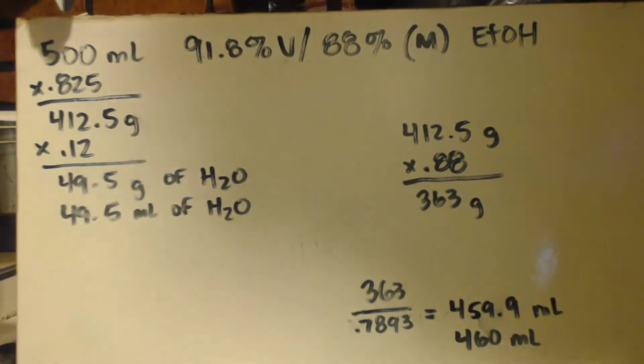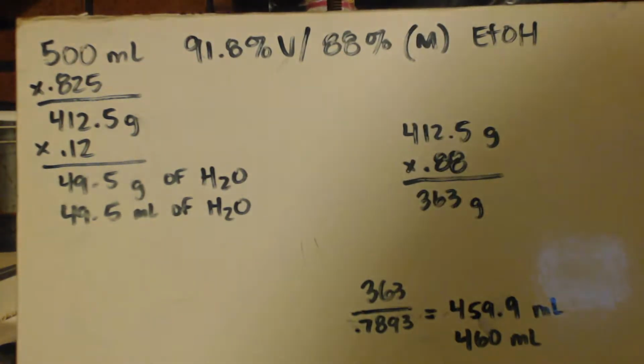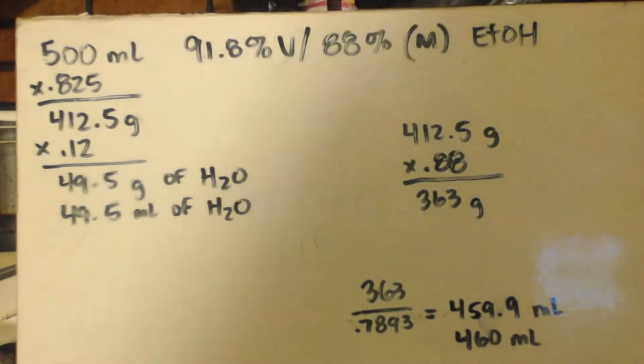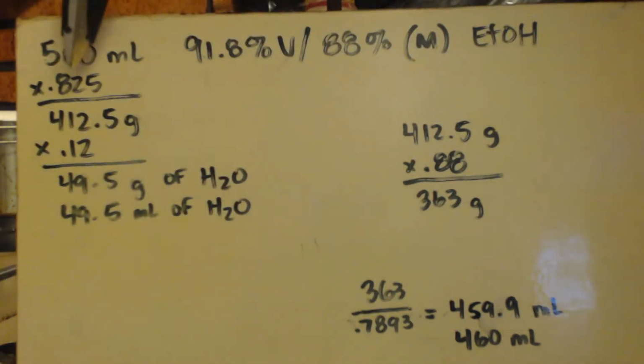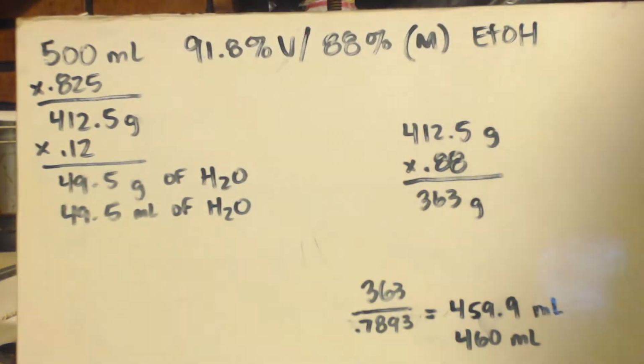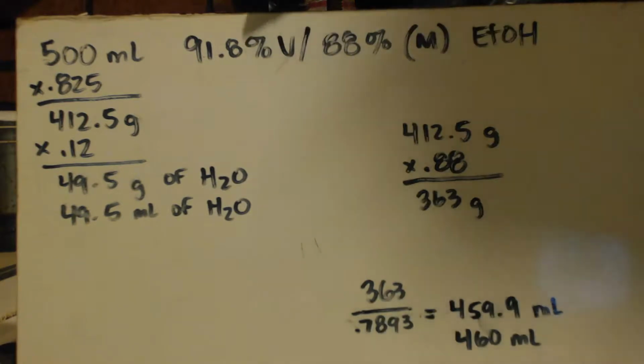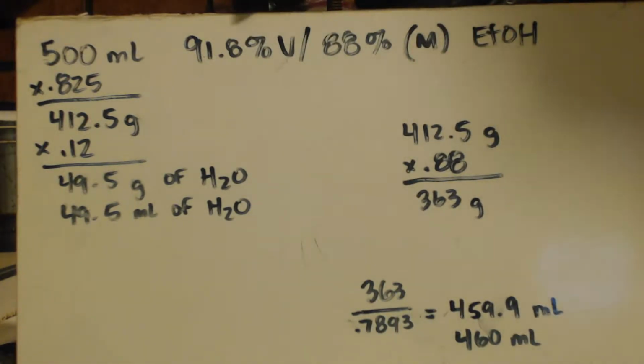I started out with 500 milliliters of 91.8% or 88%, depending on whether you're doing volume or mass, ethanol, right? And we know that the density, because I took a density test, was 0.825. So I multiply this by 0.825 to find out how many grams I got, right? Because this is grams per milliliter, the milliliters cancel out. You end up with 412.5 grams. Now we can't do the volume one because the math won't work out right. You've got to do it by mass, okay?